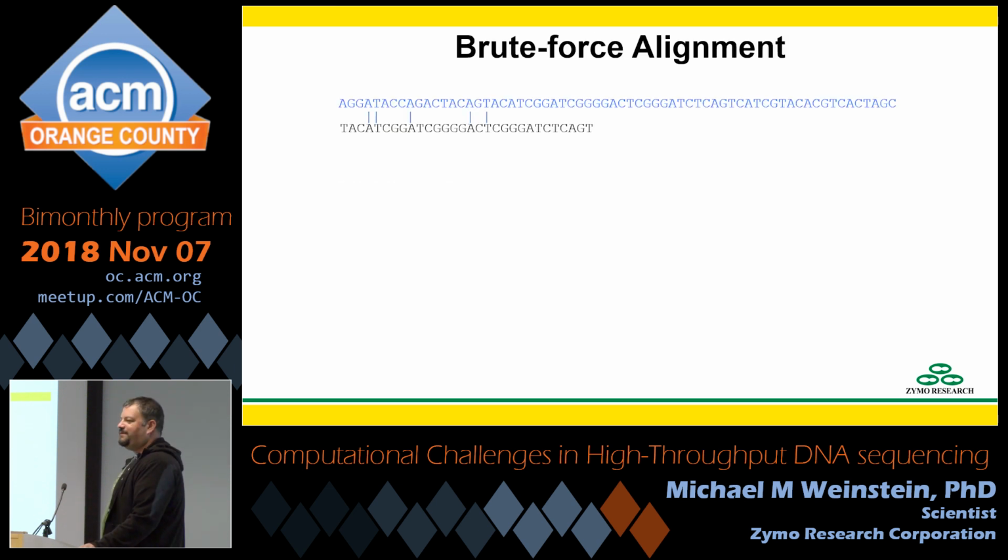This is actually a really fascinating challenge. I'm going to walk through a few different methods of this because this is really one of the more fascinating things that's been done, and it's really a big achievement that people have pulled off in the bioinformatics field. So typically if I said, I need you to align this short sequence to this long sequence, the first approach everybody will go to is what I call brute force alignment.